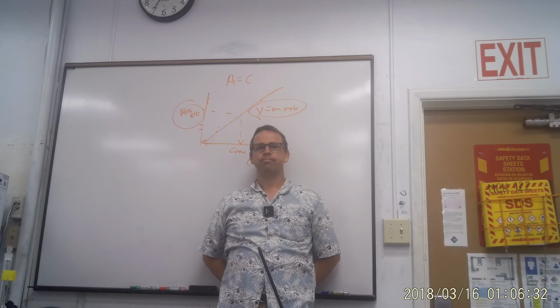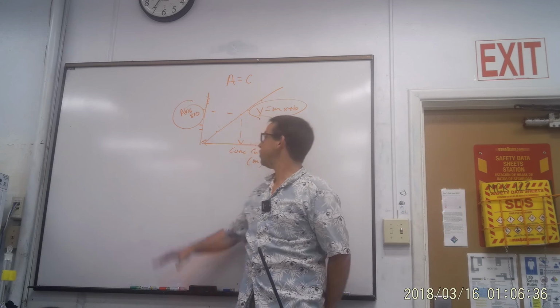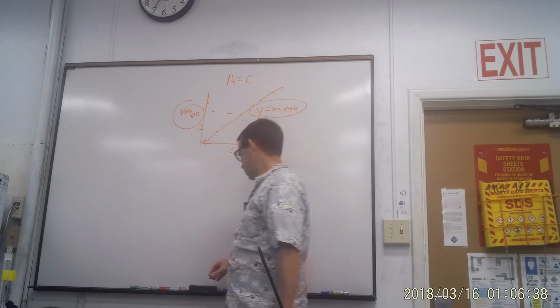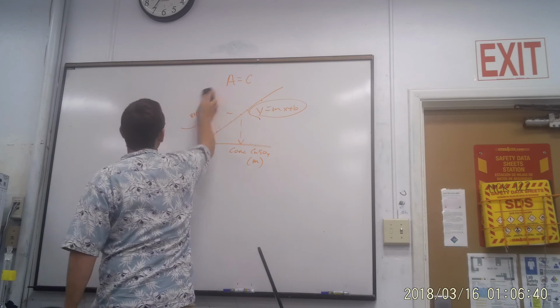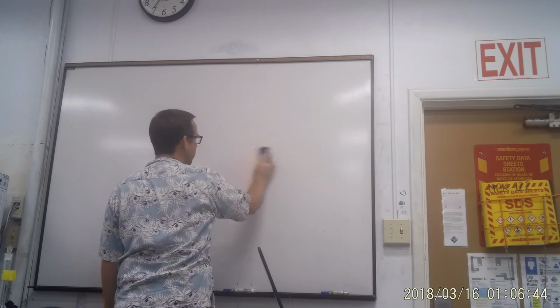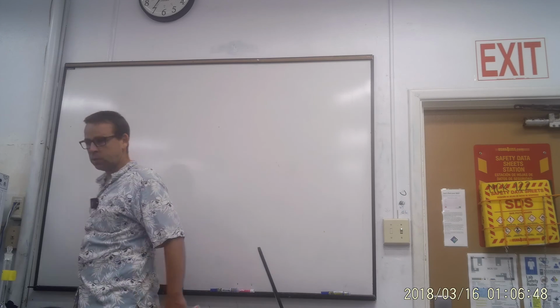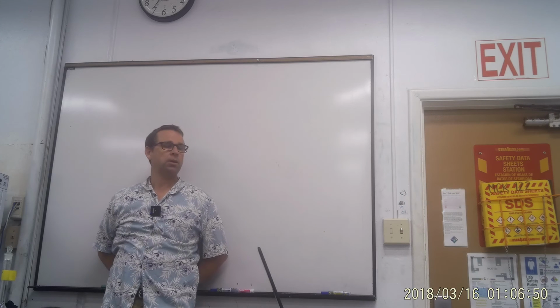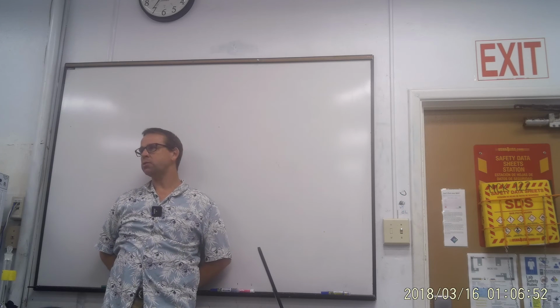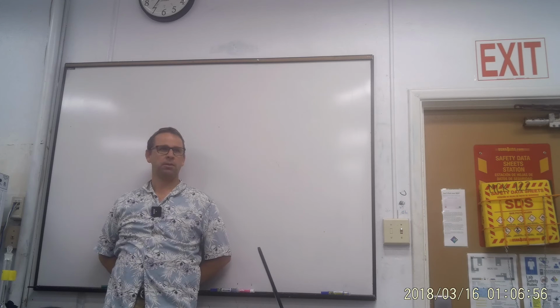Okay, so I think we know how to identify a concentration of an unknown, right? And hopefully everybody knows how to make this graph in Excel. I think we've been told enough that we need to work in Excel. We can't work in Google Sheets, all right? Do not work in Google Sheets for the rest of your academic career, all right?